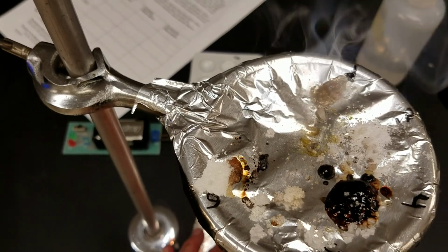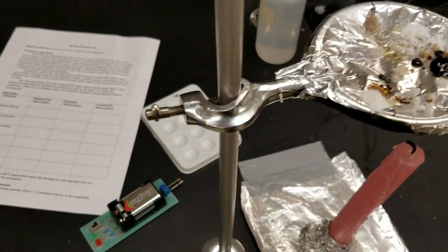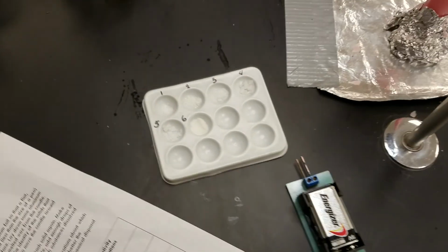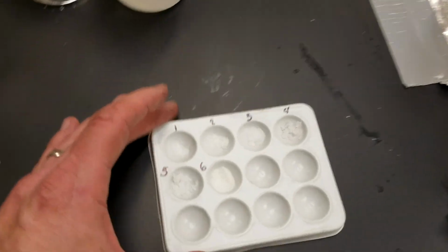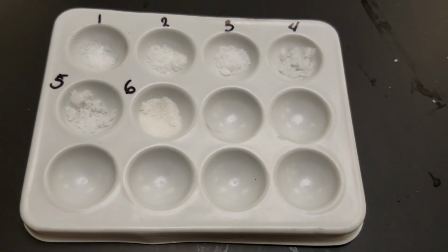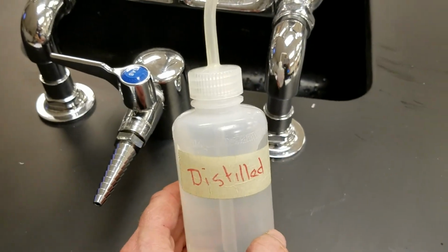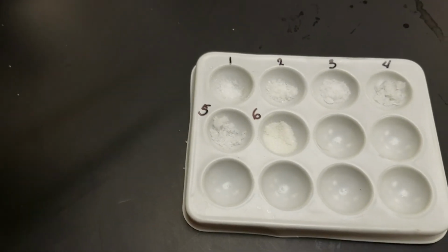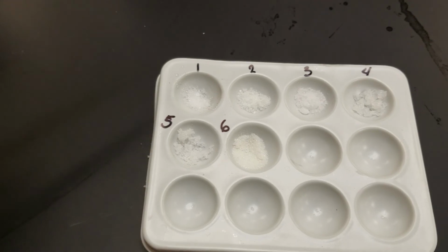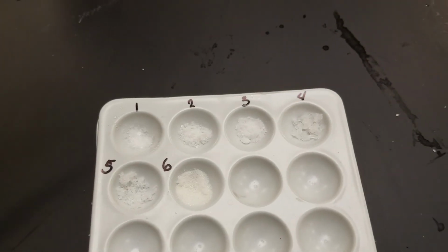I'm going to go ahead and blow out this candle, and we'll move on to our solubility test. Well, I have each one in its own well. We'll start with number 1, calcium chloride. I'm going to put distilled water in there. We want to see if it's going to dissolve completely, or if it will dissolve partially, or if it's going to not dissolve at all.